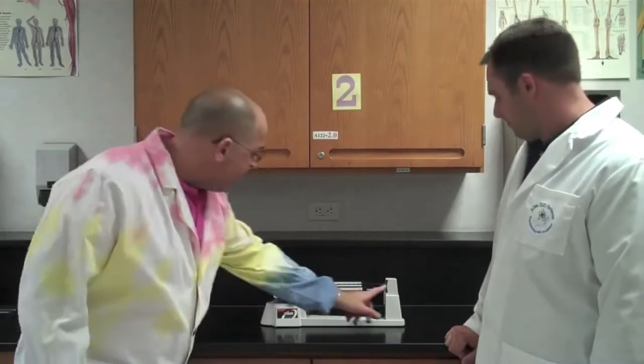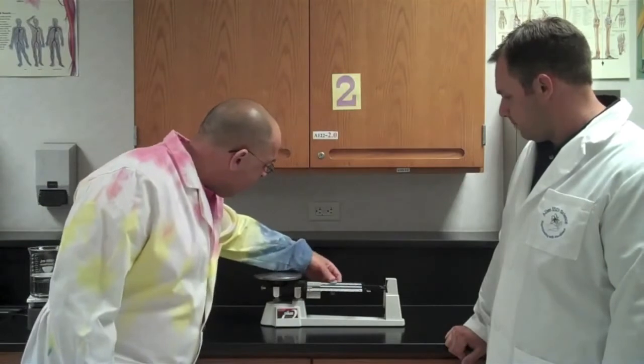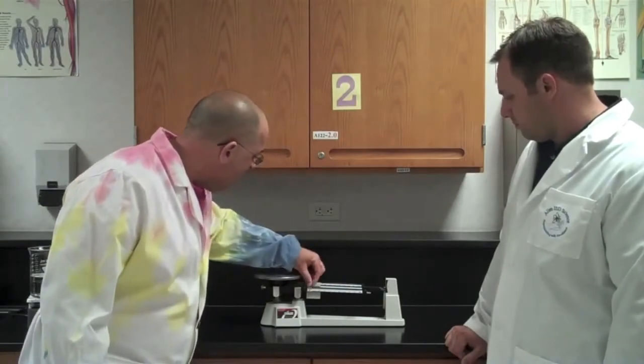So the first thing you do is you are going to make sure that the scale, the triple beam balance, is zeroed out. And so there's a zero sign right over here. And all these weights that click in have to be on the zero mark and then this thing has to be at zero because otherwise you will not get an accurate reading.